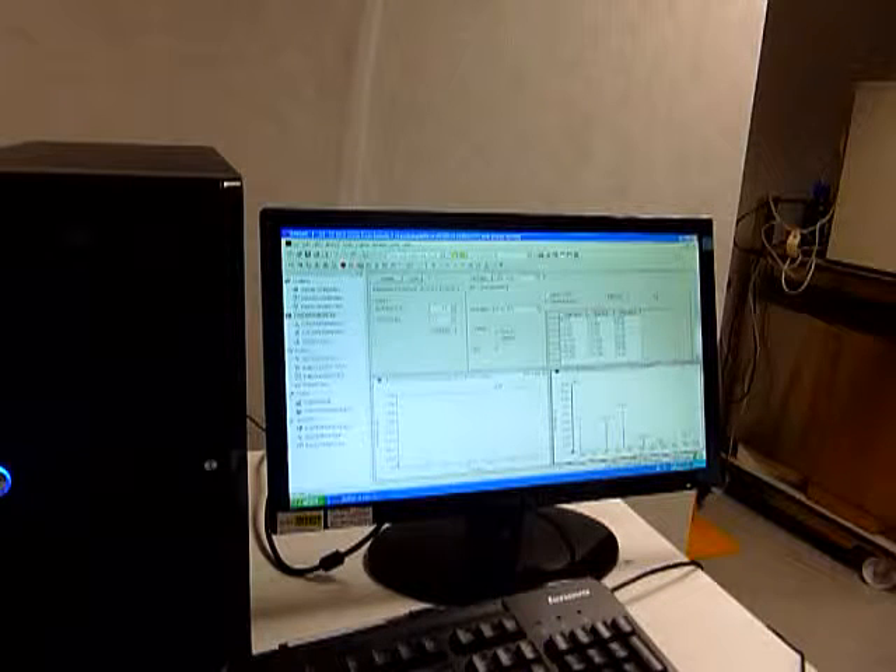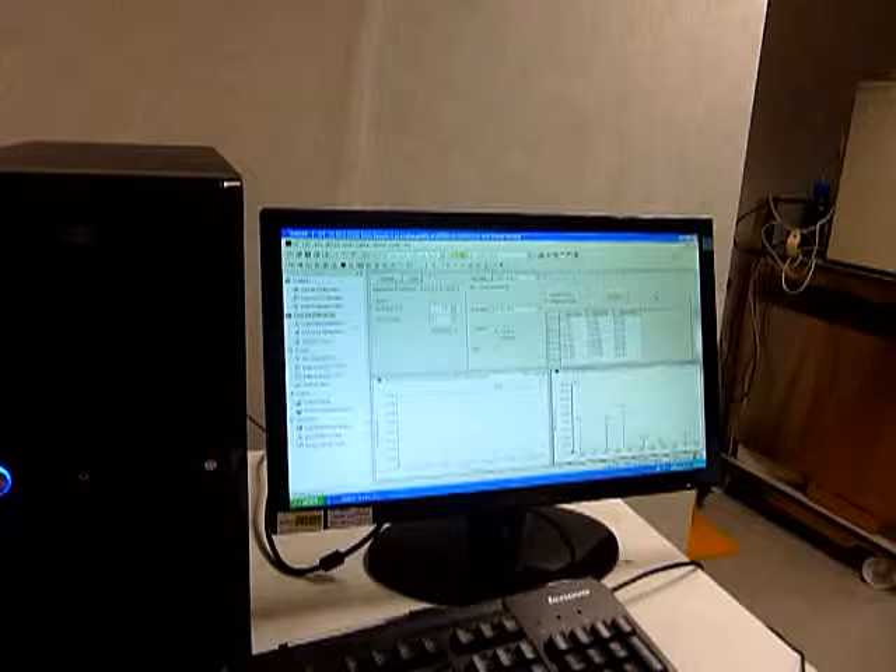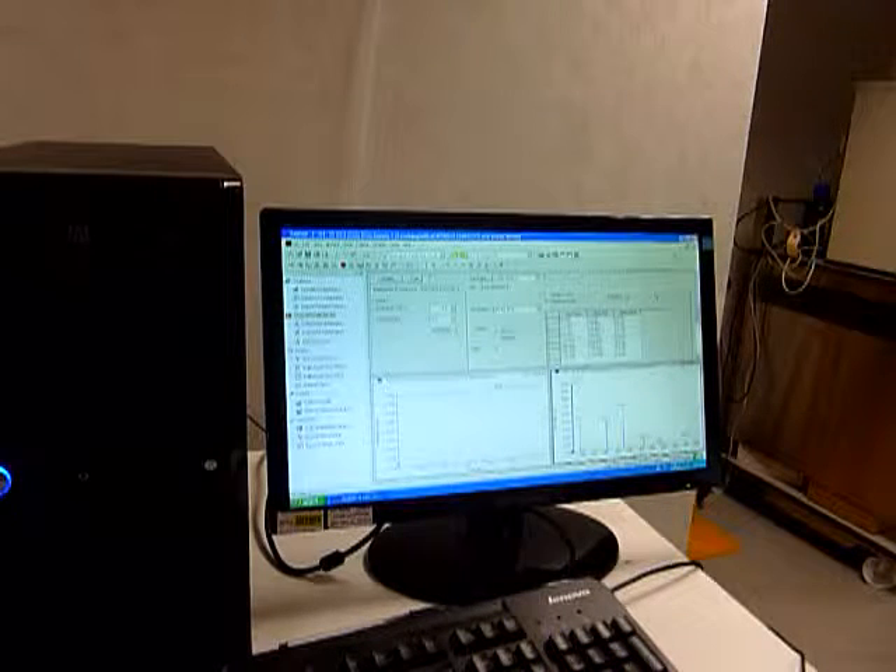The instrument is driven by the software Analyst 1.4.2. In here you have many options: you can tune up on a compound, you can tune up and calibrate the instrument using standards — PPGs, polypropylene glycols. You can acquire data, you can view data, and then you can quantitate them, all under one platform.